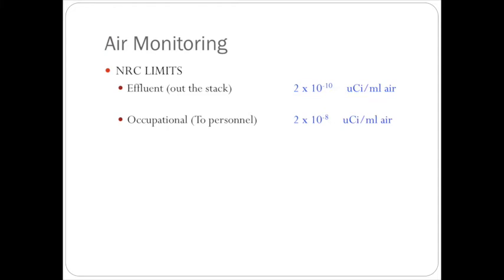Obviously, we're not going to be perfect. We can't trap everything. But we also are very cognizant of the people who are outside of our pharmacy. As I mention all the time, John Q. Public does not sign on to work with or get exposed to radioactive materials. And so if we're venting stuff outside, we need to make sure that it is as clean as we possibly can.